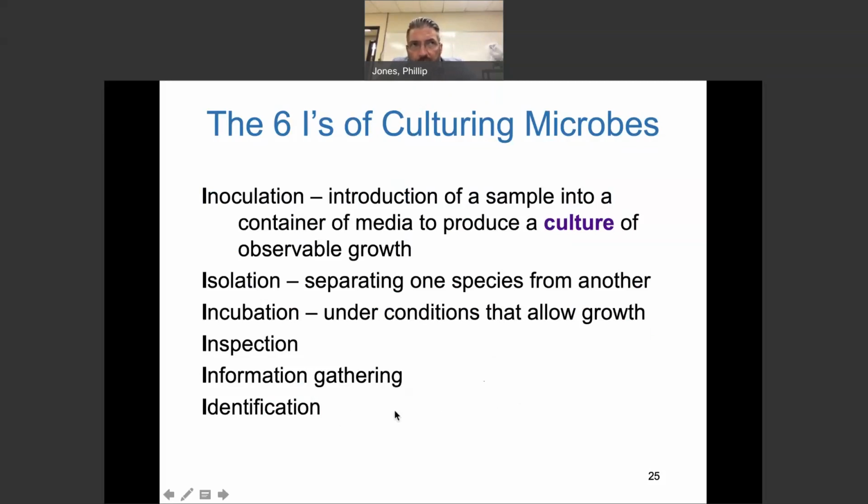So when we talk at the end of the course about the enterics, the microbiome, we'll be able to tell these enterics. They're usually all going to be gram-negative, with very similar characteristics, but there are some biological tests that can let us know whether it was a lactose fermenter, or Proteus, which has some very unique urease properties that can cause kidney stones and things like that, because it's able to produce urease. And we'll do methyl red, Voges-Proskauer to talk about fermentation.